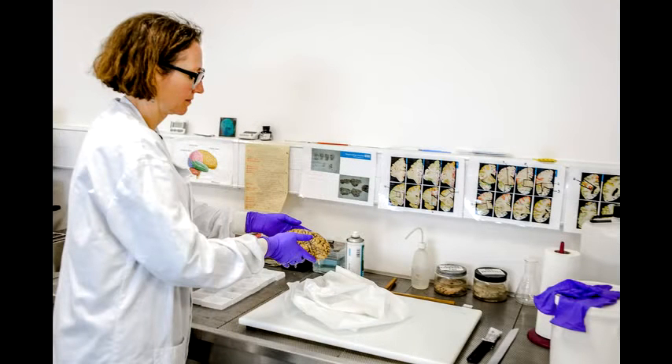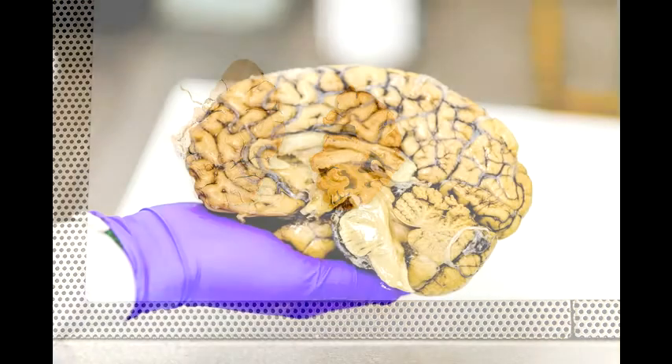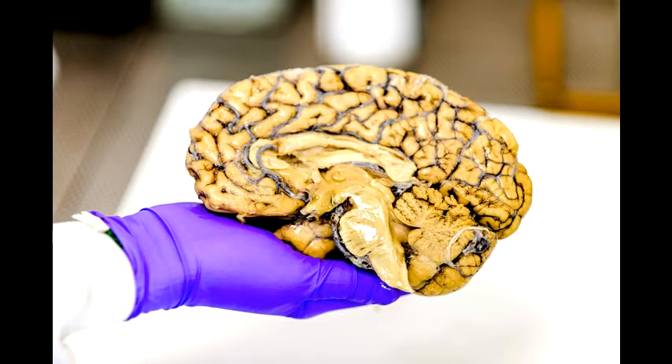When a brain arrives at the brain bank, the first thing I'll do is weigh it, because people can lose up to a third of the weight of their brain through tissue loss in Alzheimer's. I make a note of the weight and then cut it in half down the middle. One half gets put into a pot of formaldehyde and sits there for three weeks, which gently fixes the tissue — we don't do anything with that half until it's fully fixed.